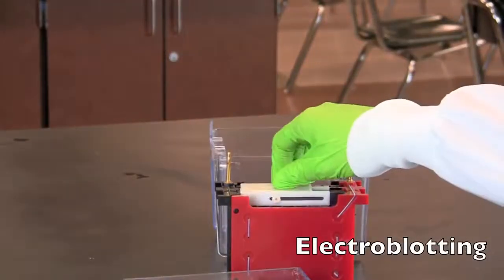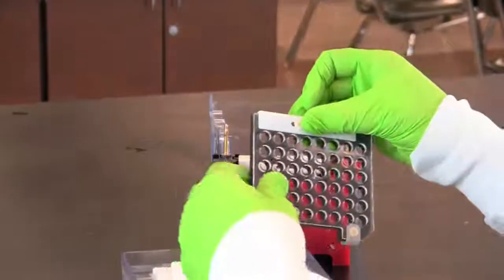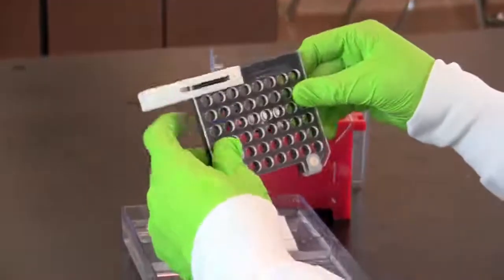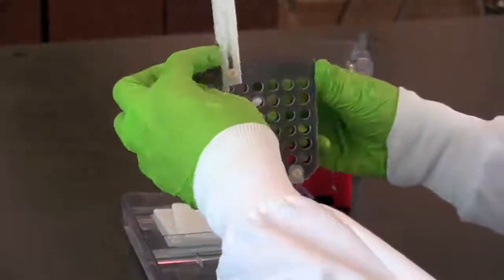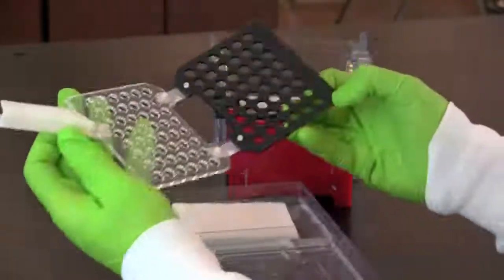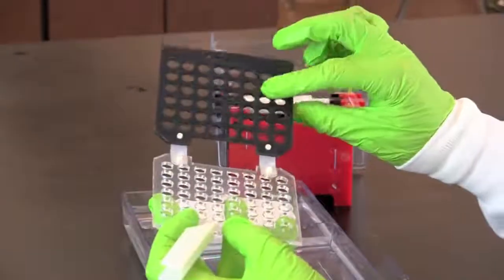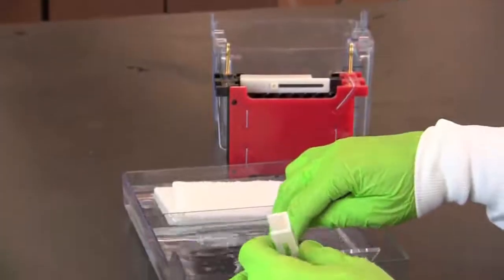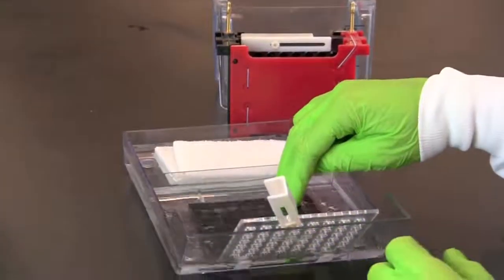To make a blotting sandwich, obtain a container large enough to fit the gel holder and add enough blotting buffer until the container is filled approximately one centimeter deep. Place the gel holder cassette in the container with the black side down and immersed in the buffer and the white side up and out of the buffer.